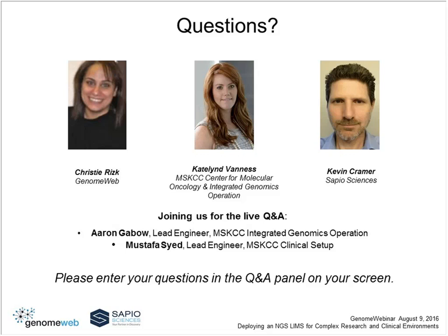Using your current knowledge, Caitlin, is there anything that you would go back and do differently regarding the implementation? The only thing that has been a major drawback was the idea of having sample names as a, we rely on the investigators to provide us enough information to develop sample names, and we tried to likely include too much metadata within those names. So if I had to go back and do it again, I would ensure that we had a unique identifier per sample that remains with the sample through its lifetime, that is not dependent on any investigator information.